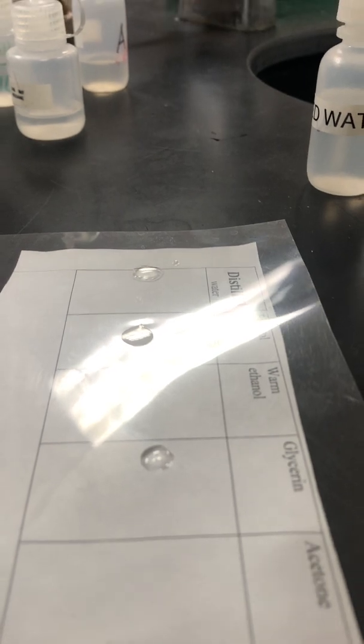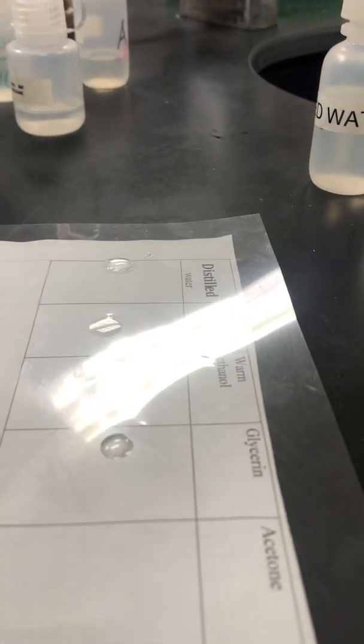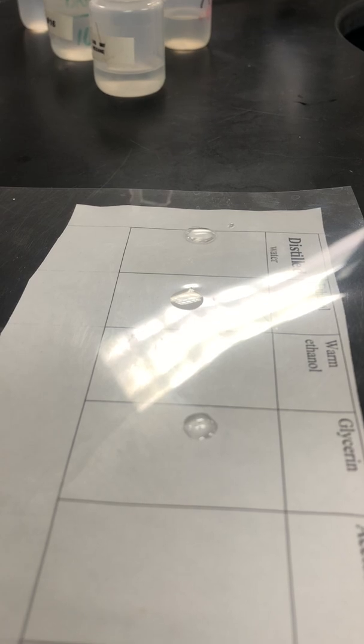Looks like the ethanol's almost gone. Still a little bit there. Boy, that glycerin doesn't look like it's changed at all. It's kind of interesting, because you can even move it around and the water and the ethanol move, with a little jiggle to it. That glycerin is a solid bead.